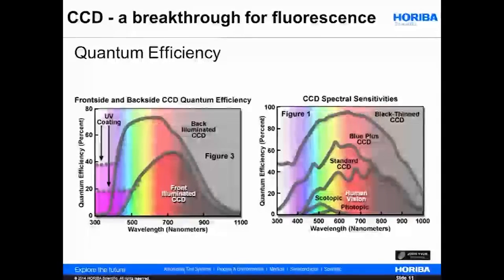Additionally, the spectral range of an eye, for instance, is way narrower compared to a CCD. This limitation also affects other detectors like PMTs, photographic plates, and so on. But if a CCD is illuminated from above, it is rather insensitive to ultraviolet light, since the electrodes surrounding each individual pixel are opaque to these ultraviolet photons.